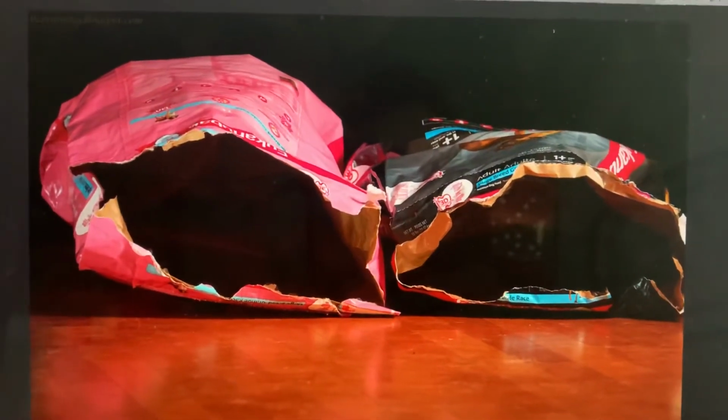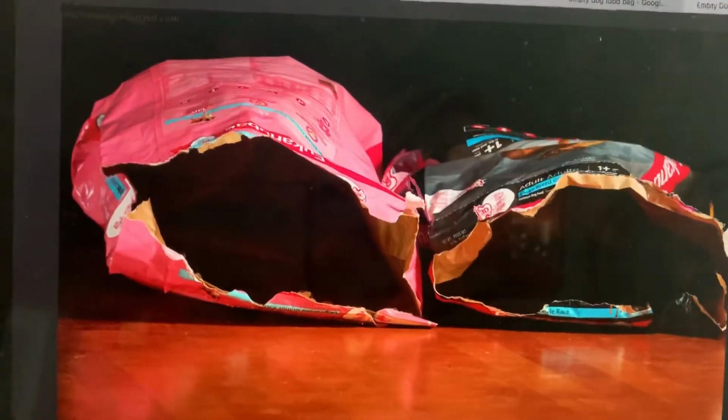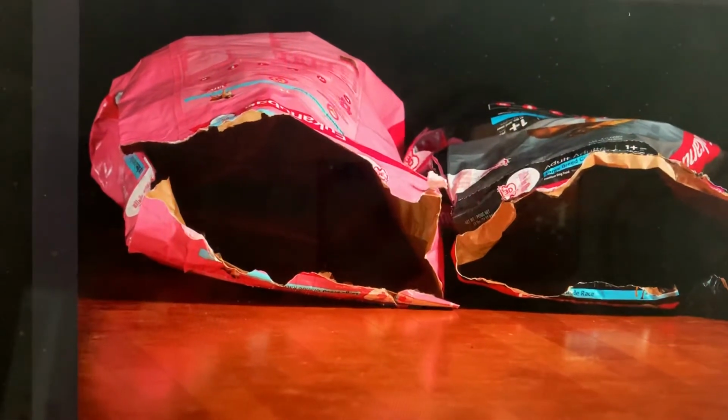The only shred of evidence left at the crime scene was a singular hair that we can use with electrophoresis to convict one of my 4 dogs, Luna, Z, Charlie, and Snoopy, of this crime.